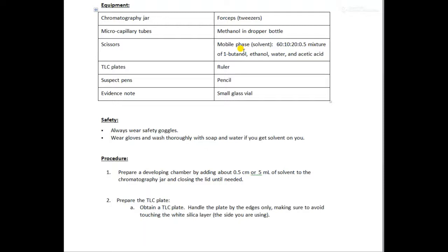At the same time, you should also get a TLC plate. Preformed TLC plates can be purchased from a supplier, or else you need to prepare a TLC plate. We will discuss how to prepare it when we are doing it. You take your TLC plate and you should not touch it with your fingers.